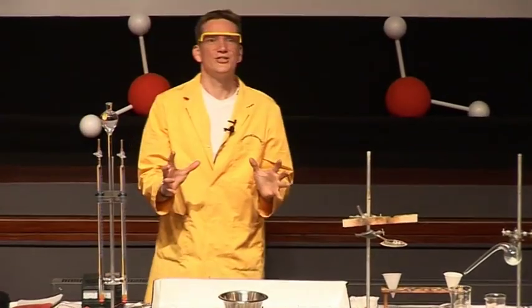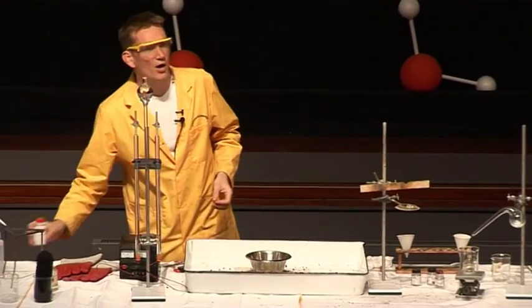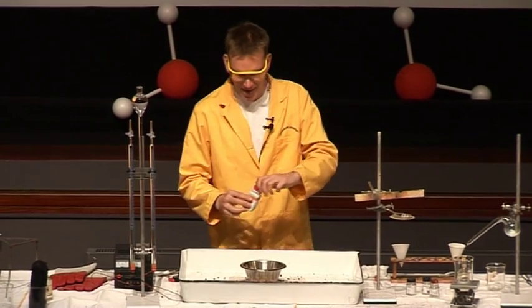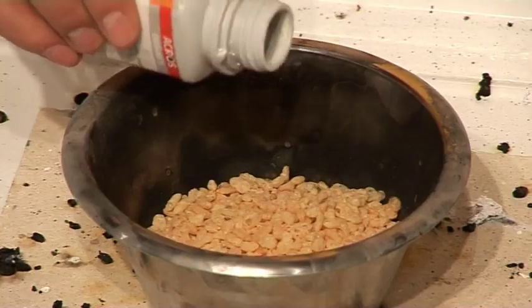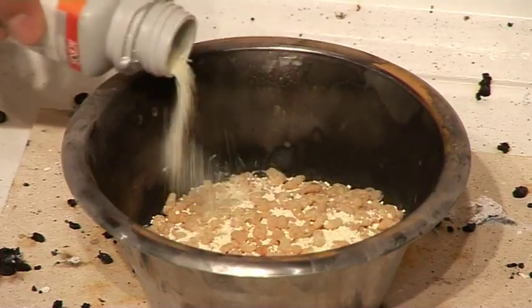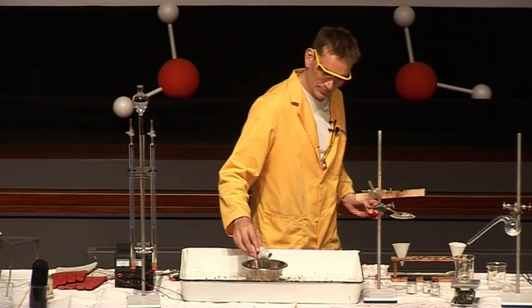So the Rice Krispies are flammable. Okay? We can burn them. After all, this is what gives us our energy. But this time, rather than using oxygen, either from liquid oxygen, pure oxygen there, or the oxygen from the air, I'm going to use a solid compound called sodium peroxide. So I'm just going to sprinkle this over the Rice Krispies in much the same way you'd sprinkle your sugar on your Rice Krispies. Okay, just mix it up nicely.